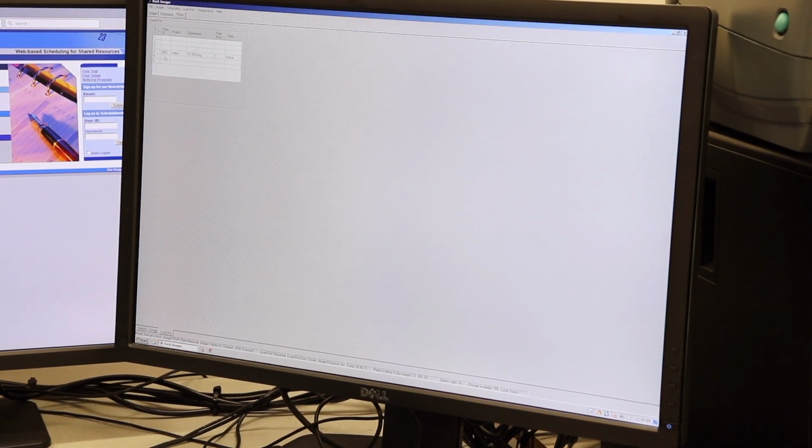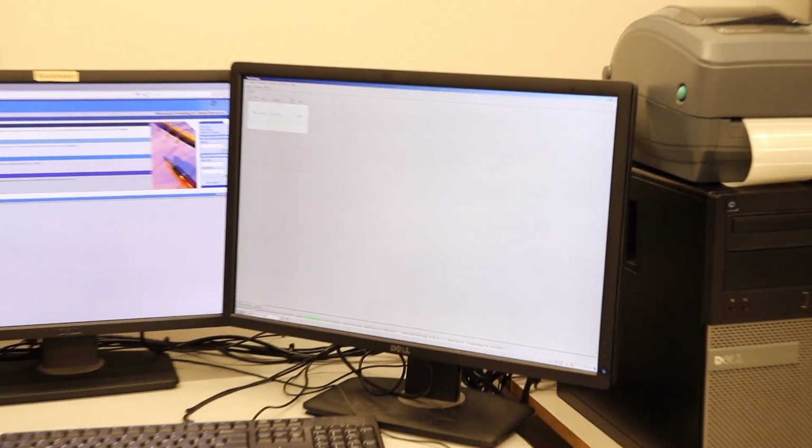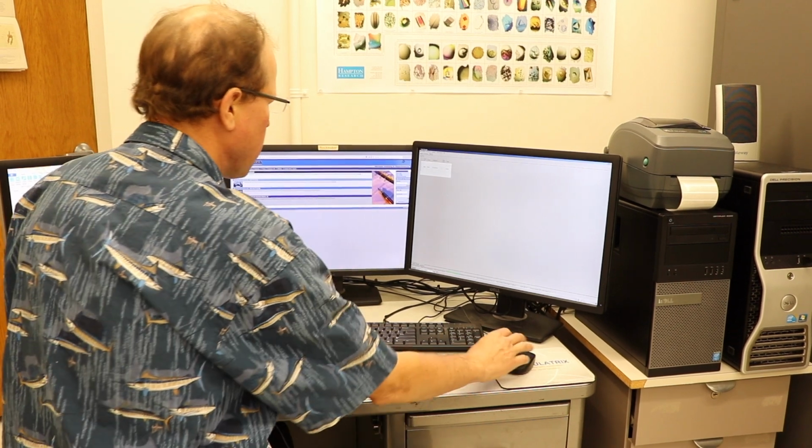We'll see our plate came up here. We'll then go to store contents. And it will temporarily put the plate up into storage, and then bring it to the fluorescent imager to image it at time 0.